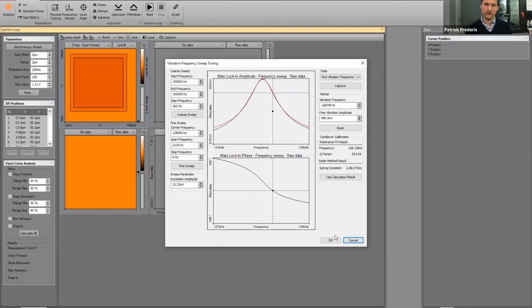You can work either on layers of proteins, unzipping bacteriorhodopsin, for example, or on cells, and then you work on an inverted microscope, or in the case of the Core AFM with the DEMO, the integrated optical microscope. You look where the cell is, put the cell under the cantilever, and do a map of elasticity forces, for example.